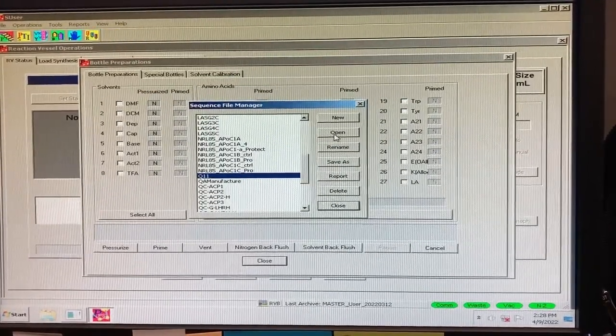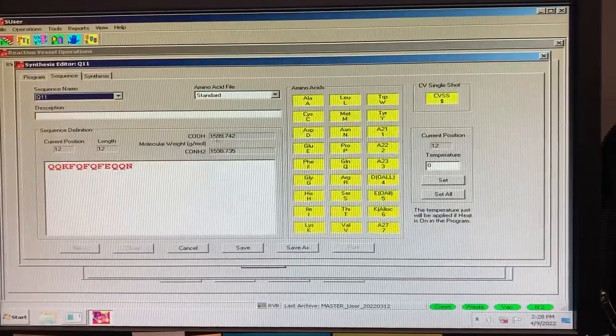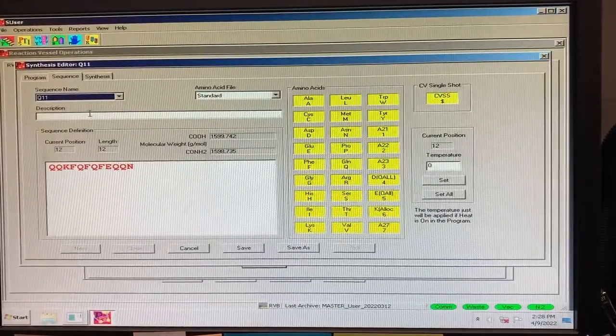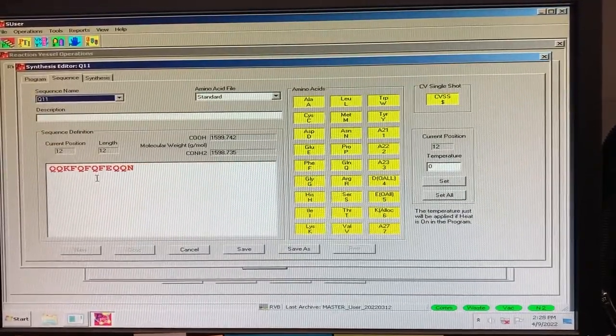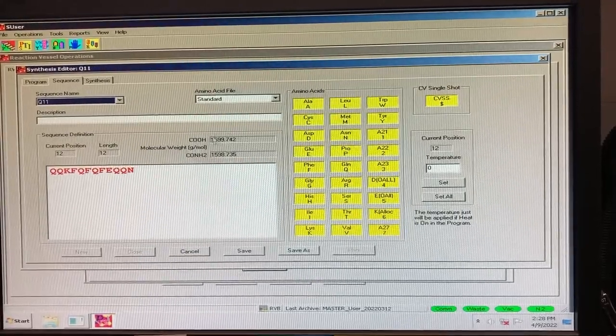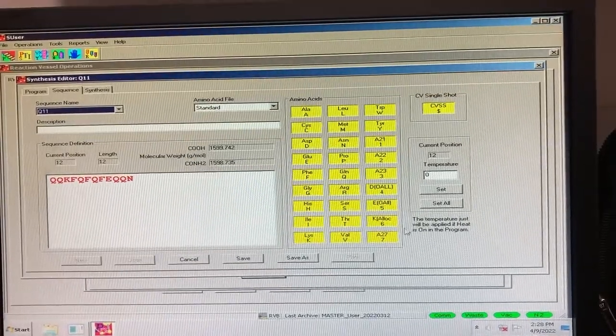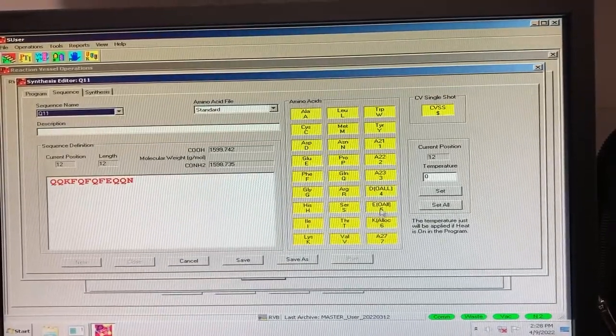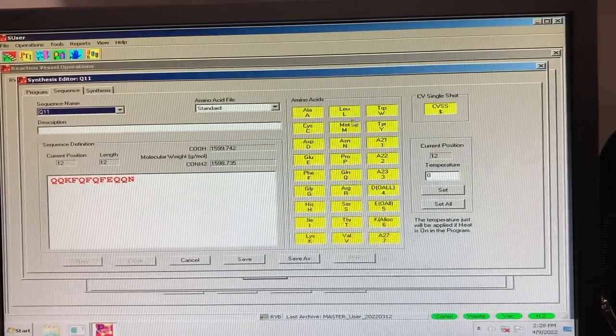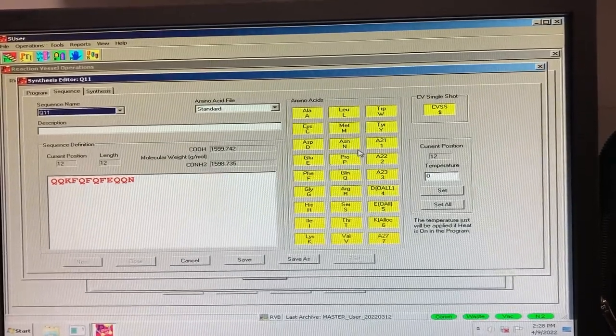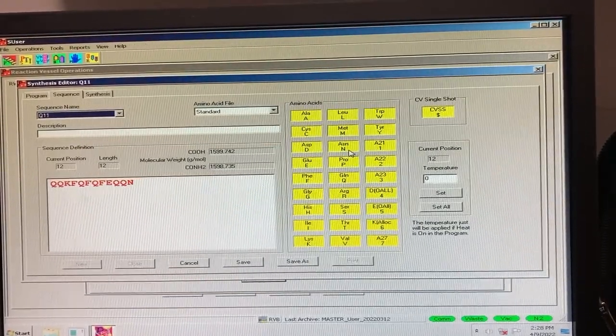This opens a window that has tabs for Program, Sequence, and Synthesis. In the Sequence tab, you can select a pre-existing sequence file and see the amino acids within the sequence, as well as the one letter or number designator for each amino acid. If you want to make a new sequence, refer to the corresponding video in the playlist.